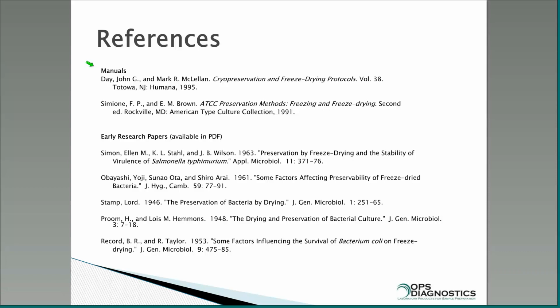Okay, next question we have here is, how will a strain maintain its viability? Oh, that's a question. I don't know if I can really answer that. Essentially what the freeze drying does, based on the lyoprotectant, and why a disaccharide with no free anomeric carbon, I don't know.